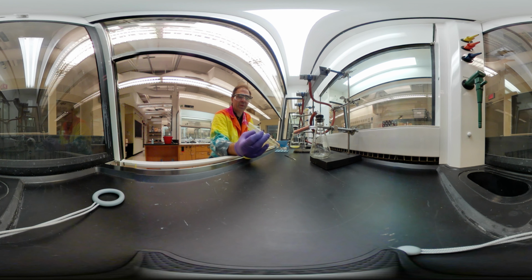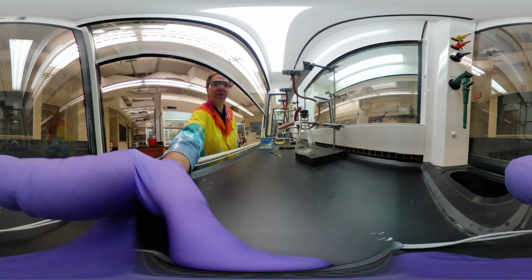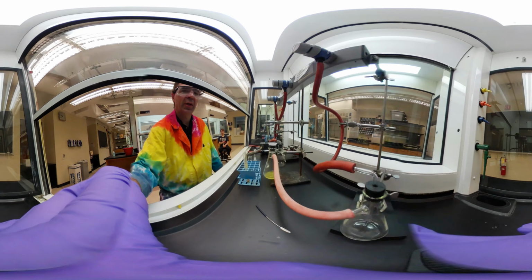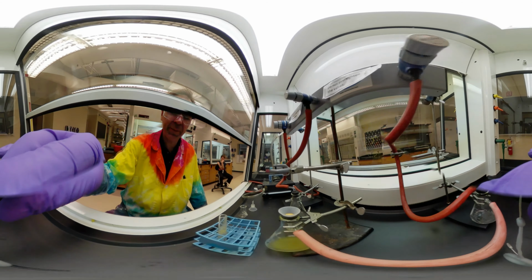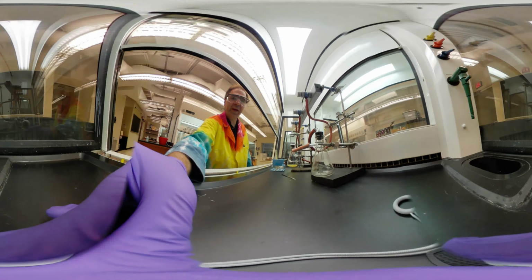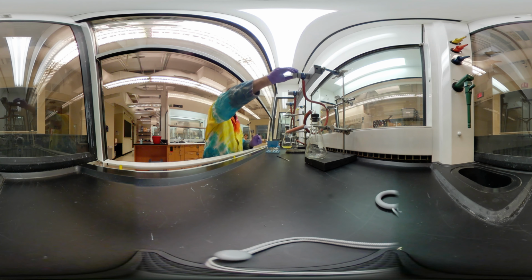Now, a lot of times, when we clean this out or use a new one, we're actually going to use the same test tube for the second part. But hopefully, yep, there we go. We're supposed to have a light yellow to orange intermediate. So I'm going to pick you up. And there you go. There's our product. Okay. So we don't need to get it very dry. The idea here was just to get most of the solvent off. So I'm going to turn that off.